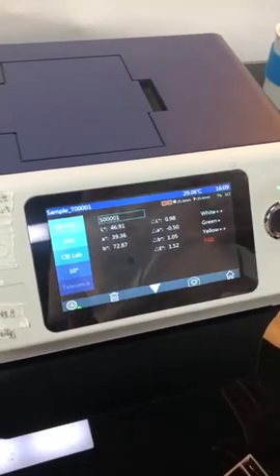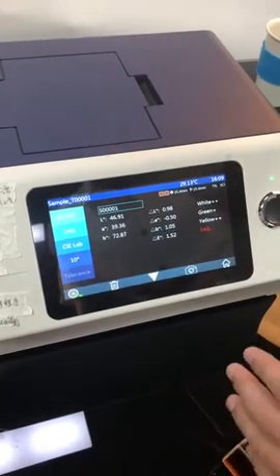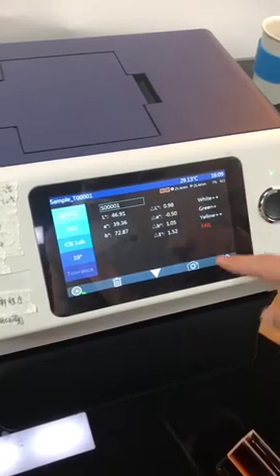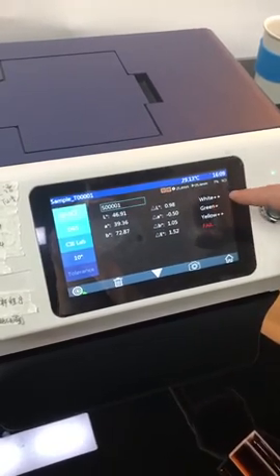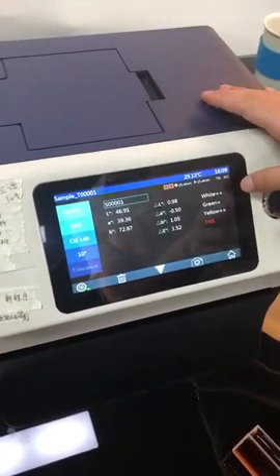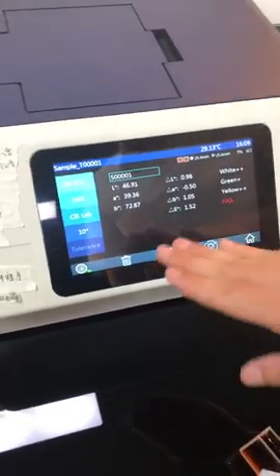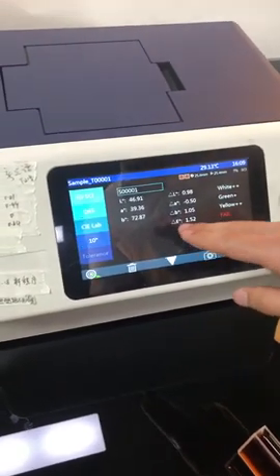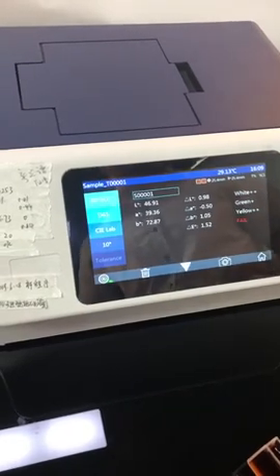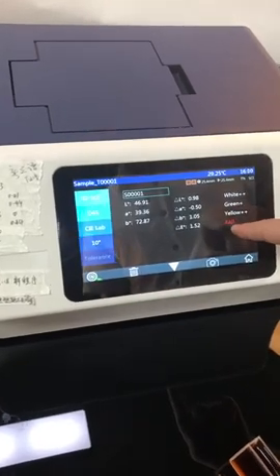Press the button. This is the measurement result. It shows the color difference between sample A and sample B. Sample B compared to sample A is whiter, greener, and yellower. The total color difference delta E value is 1.52. It's beyond the tolerance, so the result is failed.